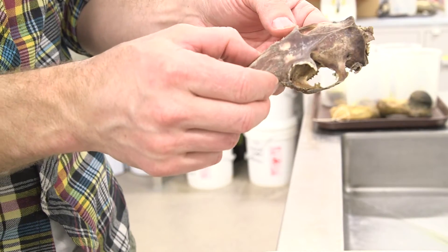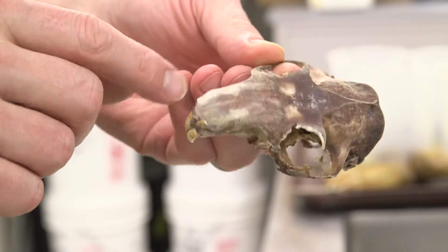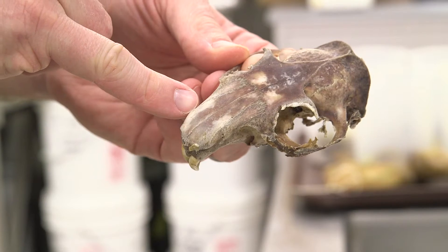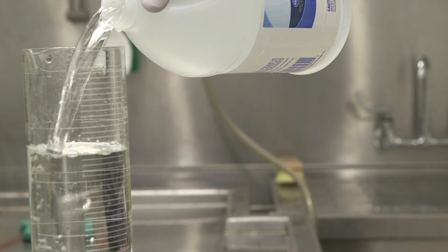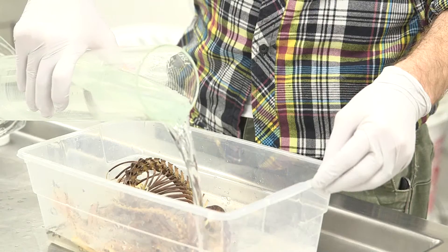The discoloration in the bones is caused by a grease or fat that needs to be dissolved out of the bones before they're ready to be installed into the collection. We soak the skeleton in a solution of ammonia to dissolve this fat.